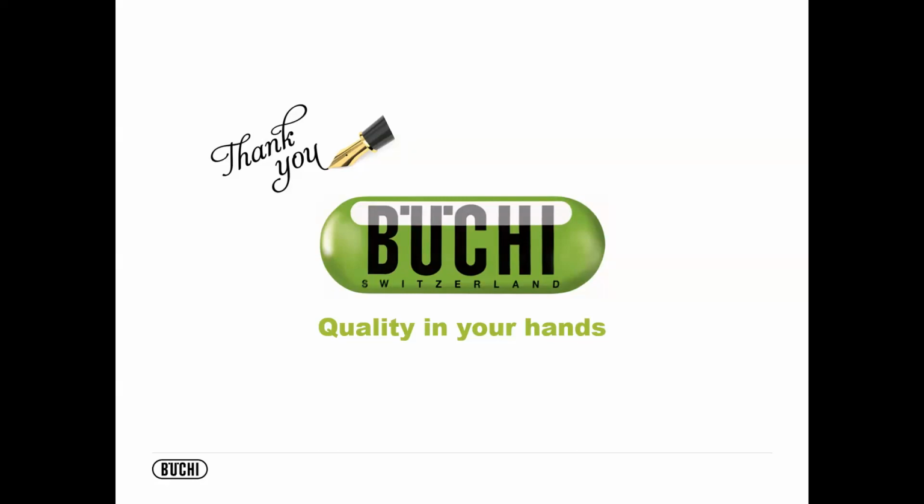Also when it comes to solids. So as I was saying, if you have a large sample variability, Kjeldahl is really going to accommodate every different type of sample that could come through. Same thing with flow injection. You're not really going to be able to use solids or anything that has any debris in it. There are a lot of different pumps that can very easily be clogged, and a lot of leakage issues.